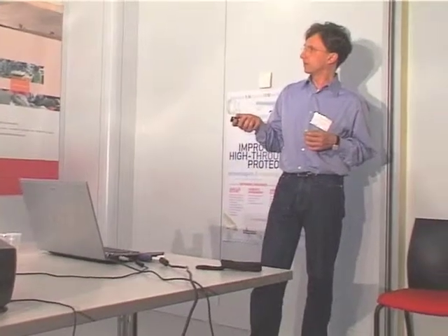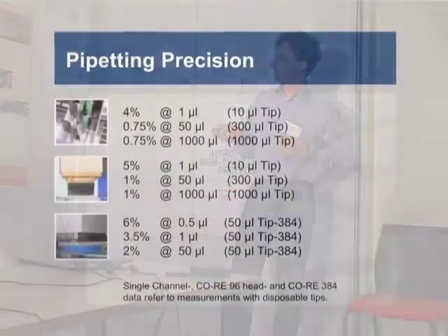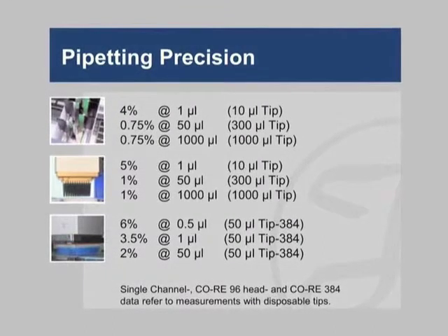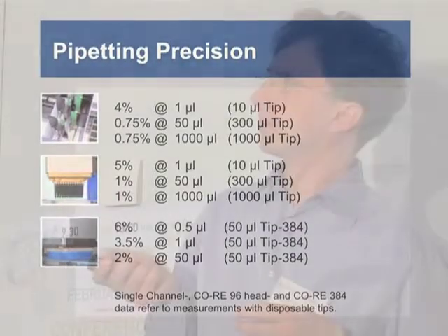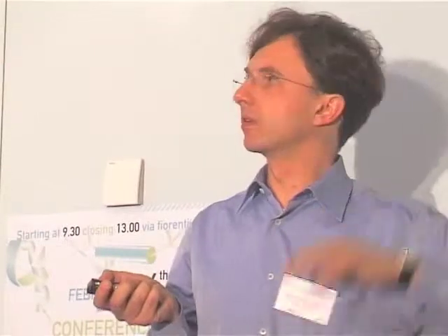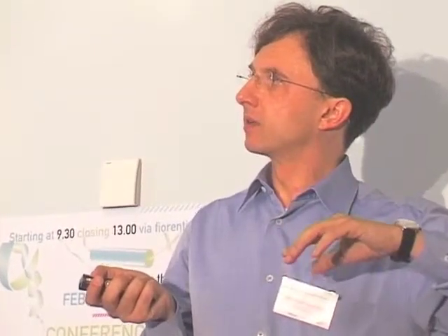You can see how the tip is following the liquid here, and again for the organic liquid. So the tip is always following the liquid, and you can also calculate the volume of the liquid, because when you have a proper labware definition, then you can hit the liquid level, and then you can in that way calculate the volume that is in your bottle, or in the deep well plate, for example.